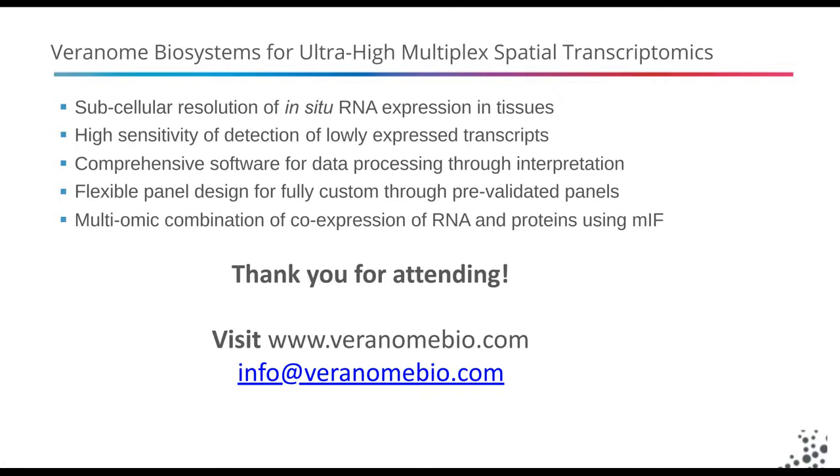Great, thank you so much. Now, I believe this may have been mentioned in the presentation, but just to confirm, can this be used on human brain tissue? Oh, yes. Yes, we're currently doing a lot of, oh, sorry, go ahead, Brian. Yeah, absolutely. We've got a lot of applications coming in on the human brain, and we're actively generating data on that right now.